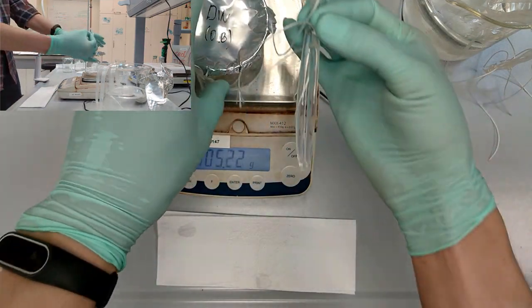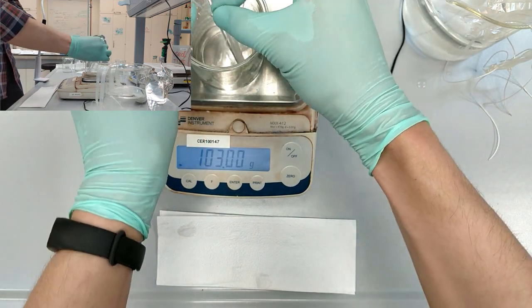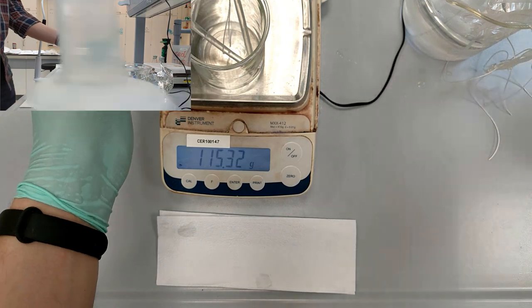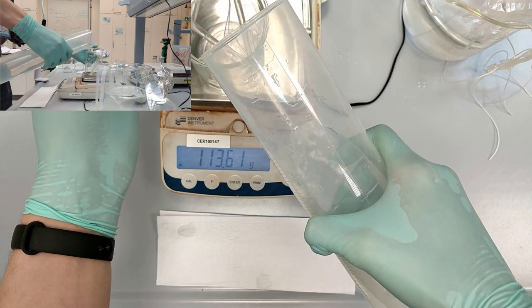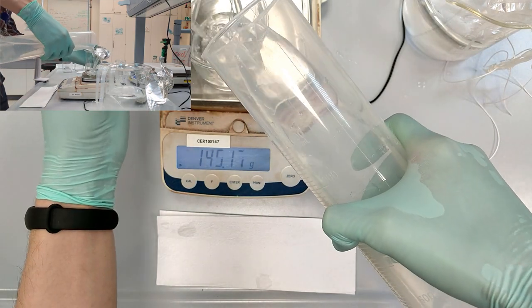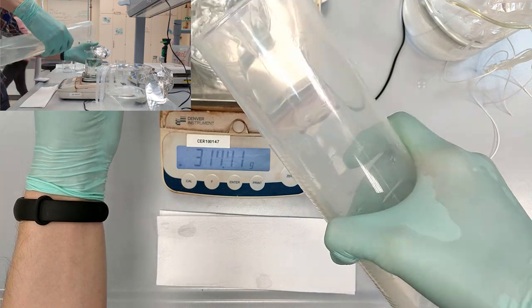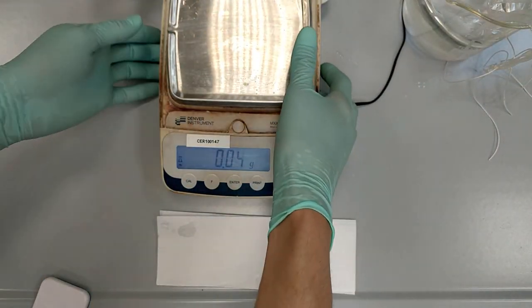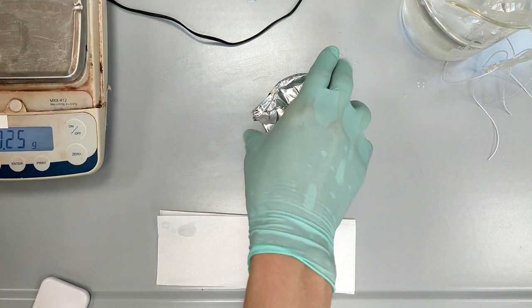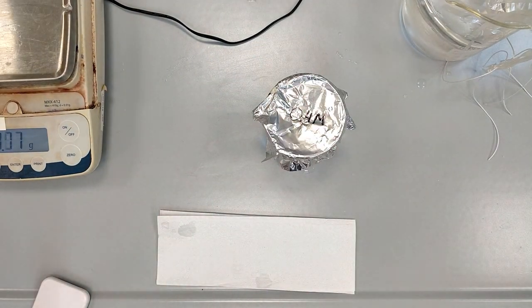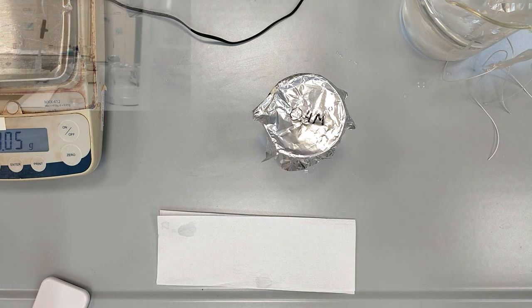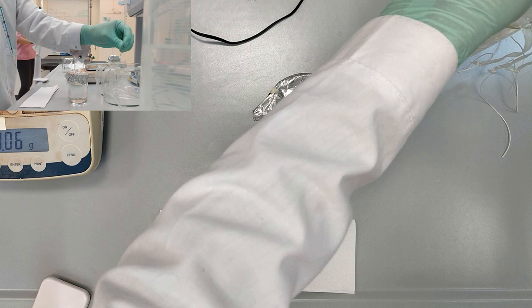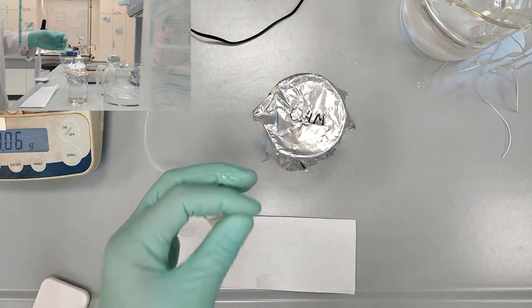Label the beaker, put the dialysis tube inside and pour 200 ml of water. Now prepare the 0.4 molar concentration dialysis tube.